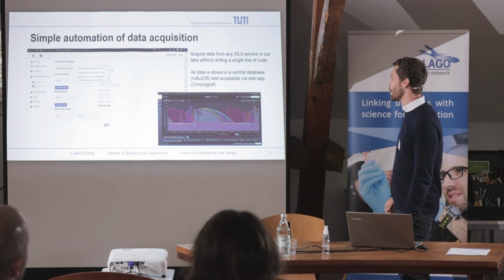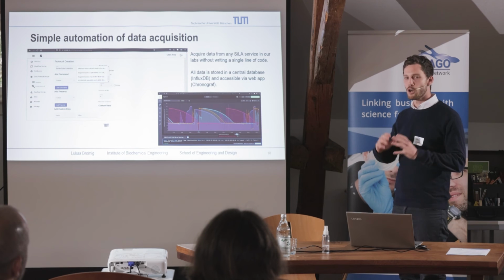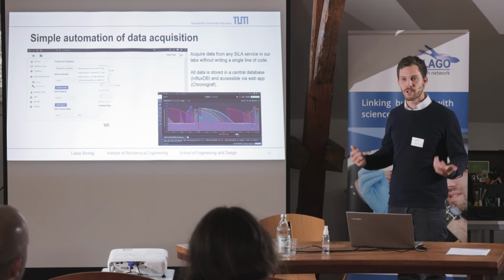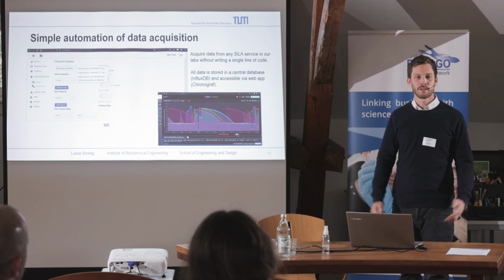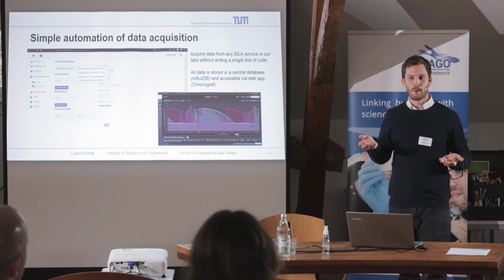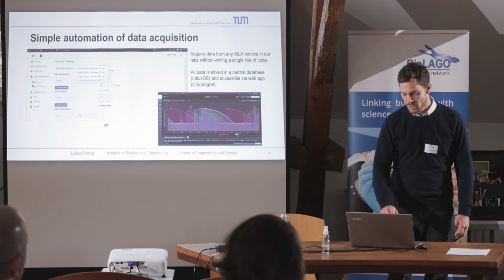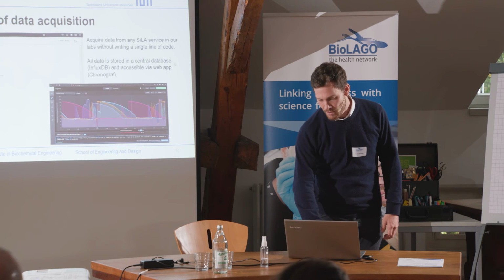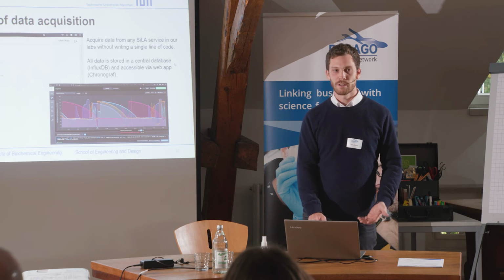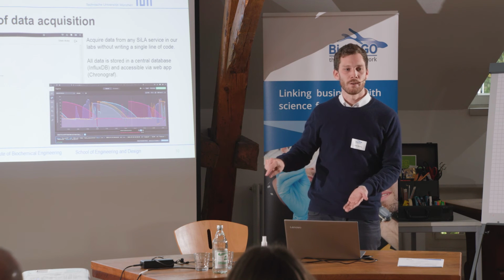So especially for the analysis part afterwards, it's so much nicer, because you just have a whole batch of data and you download it at once, and you can immediately import it in Pandas, in Python, in Jupyter, and start your analyses. And you don't have to harmonize those different data sets. So that's also an advantage that we have now due to SiLA. Even students that don't know how to code, that don't know how to integrate some device, can just select it and push the data where they want it.